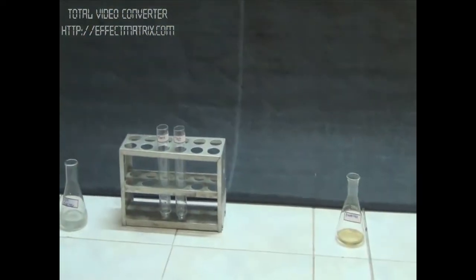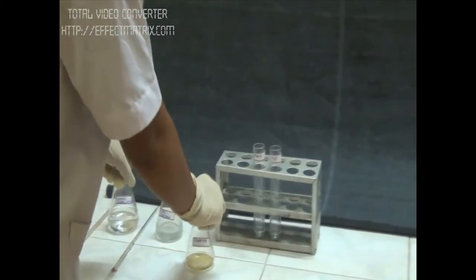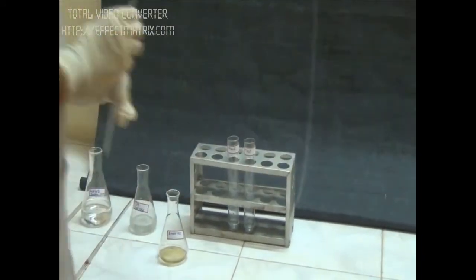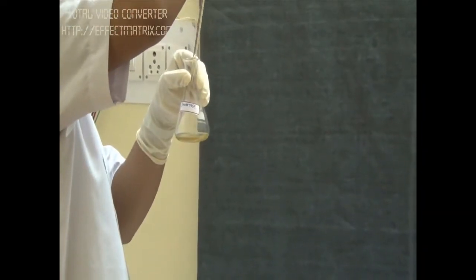We add 1 ml buffer to both tubes. We'll add 0.25 ml of enzyme invertase to the test tube only, as we want the reaction to proceed in the test tube only.